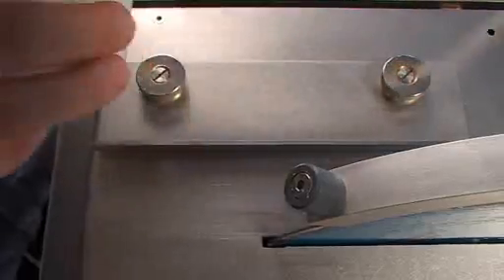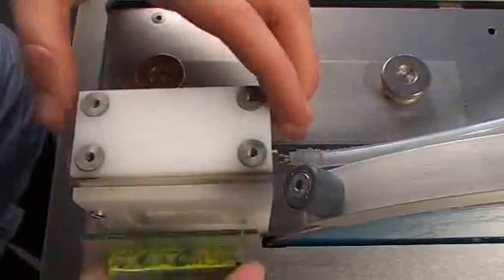Once the sample has been ground and glued onto a microscope slide, the thin section is cut from the block by using the other side of the vacuum holder.